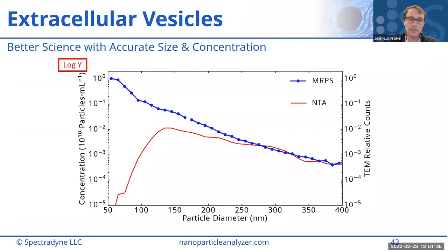Okay, so it's better to test the sample, and if they are concerned, to repeat with some agent added to the mixture with the sample? Yep, you can, and we can point you to places in the literature that have done specific studies on the lability of EVs in different surfactants. I'd be happy to help with that. Okay, thank you. Yeah, that's helpful.